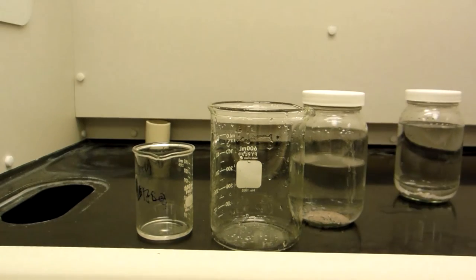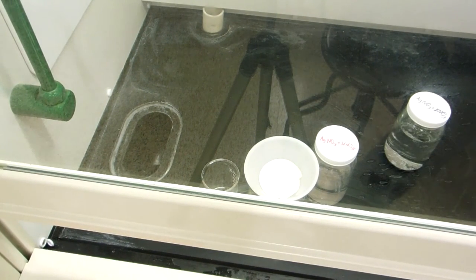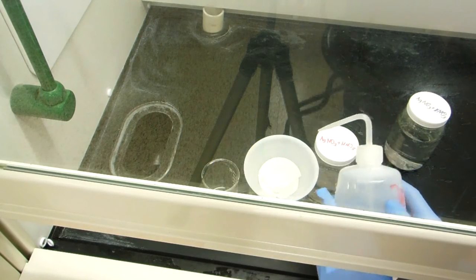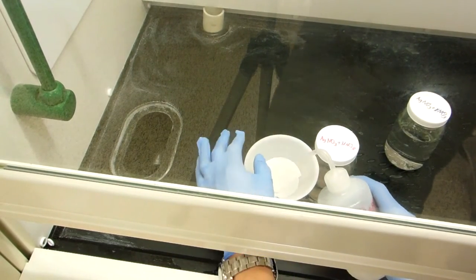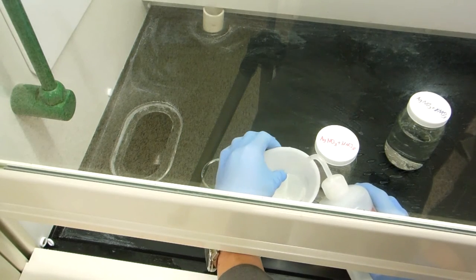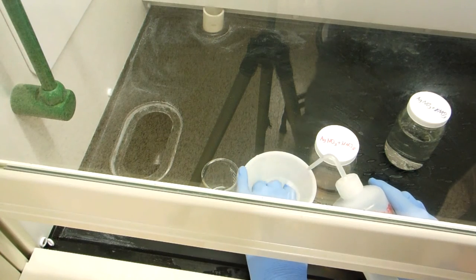So I just do it right there, and I stick it back onto the beaker. And so now, looking from a bird's eye view perspective, I use some deionized water from a wash bottle to get the sides of the paper wet so that they can adhere to the sides of the funnel better. So I go at it a second time, this time twisting the funnel and pushing on the sides of the filter paper to force it in place. So the water acts like a glue to stick the paper to the inside of the funnel.